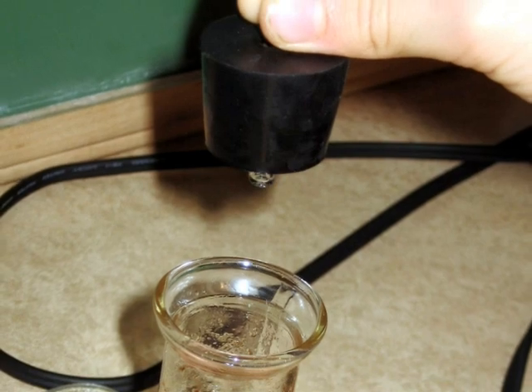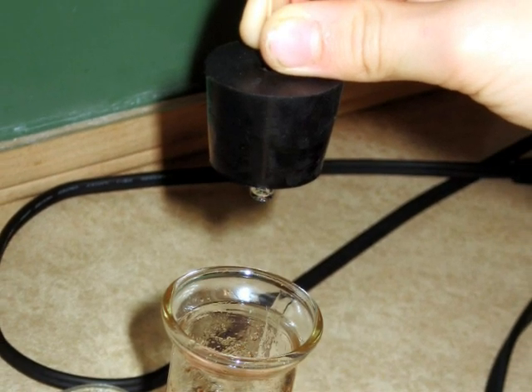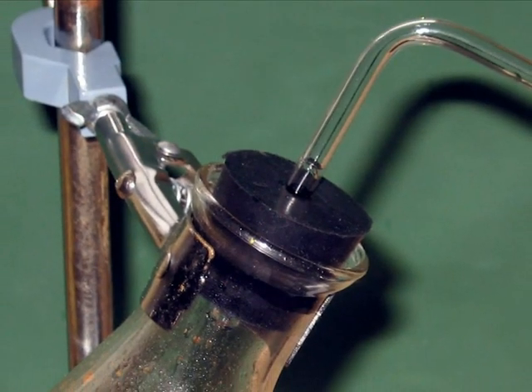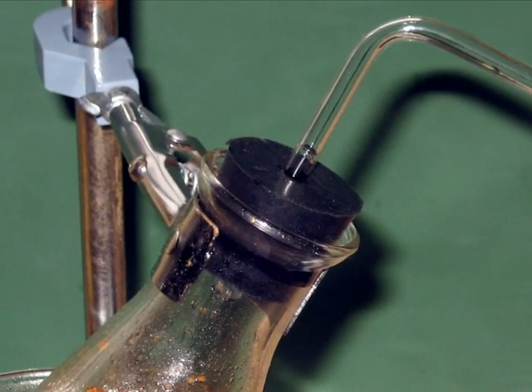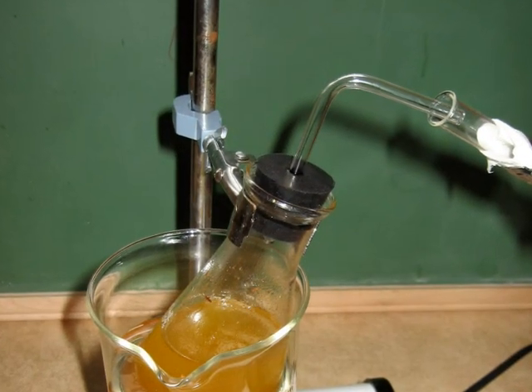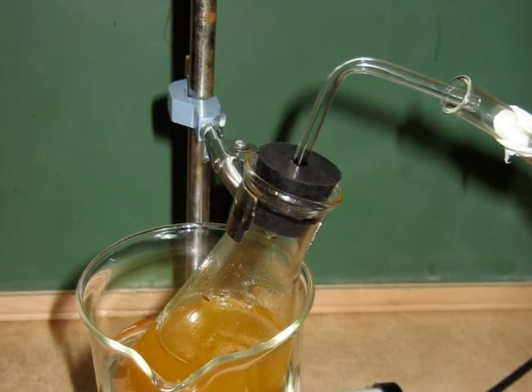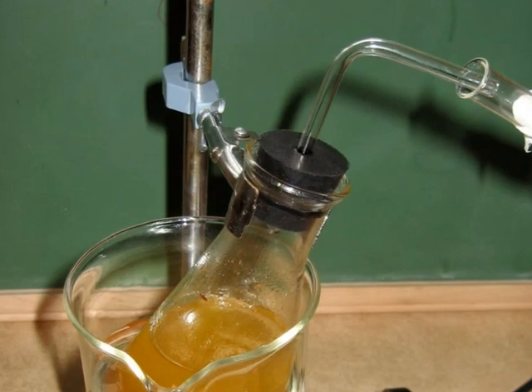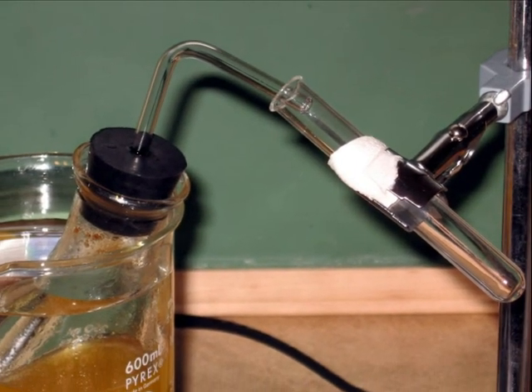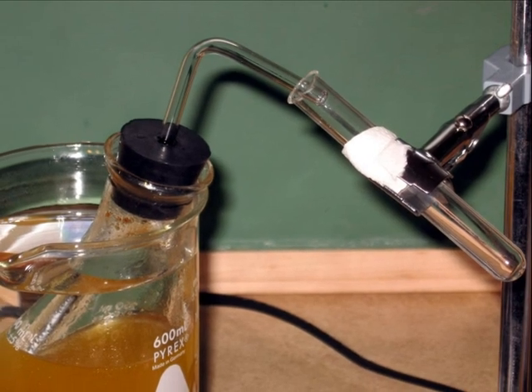Insert your stopper with the glass tubing into your flask. Make sure that the rubber stopper is snugly seated in the flask. The glass tubing should be at least 5 centimeters above the liquid in the flask. The mixture in the flask should be below the level of water in the hot water bath.